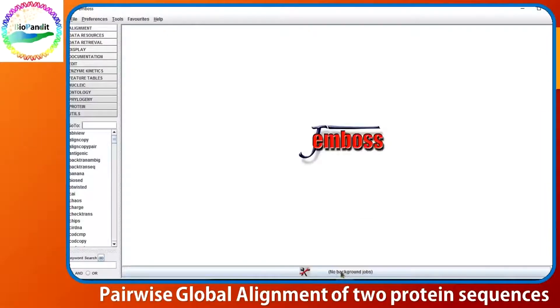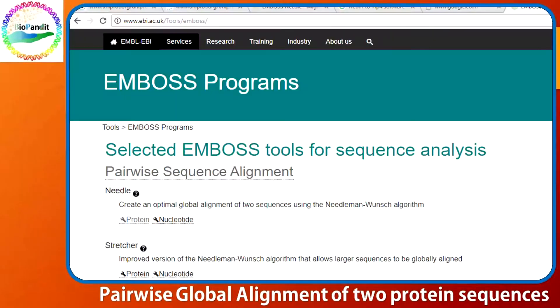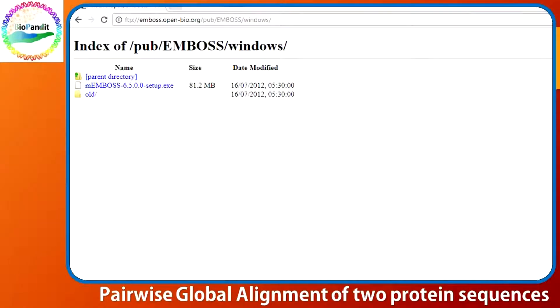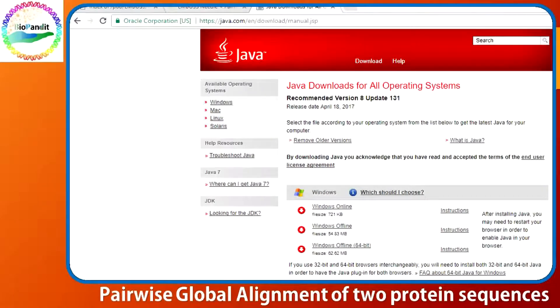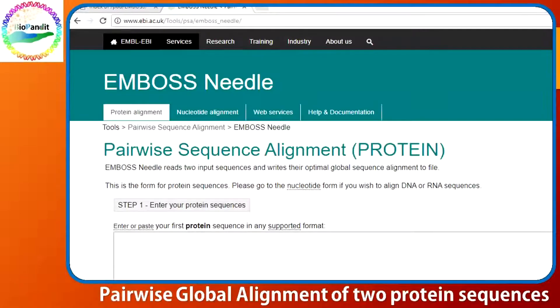Now we need our alignment program. The Needleman-Wunsch algorithm is implemented in the EMBOSS program. EMBOSS has a standalone version and a web server version. The Windows standalone version can be downloaded from this link. Obviously, it requires a 32-bit Java being pre-installed in your computer. Alternatively, you can go to this online server to perform the same operation.